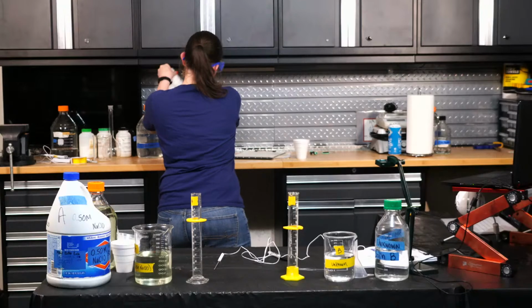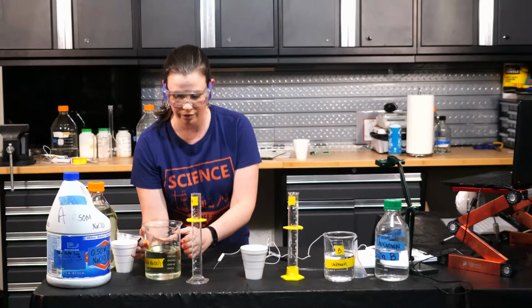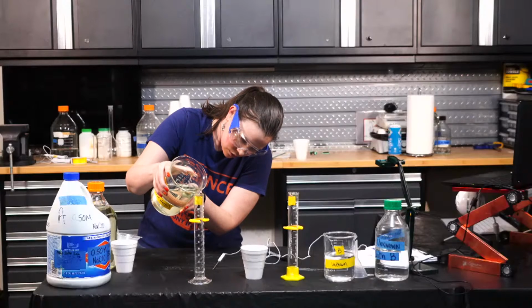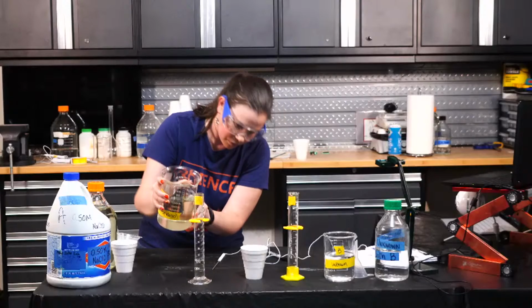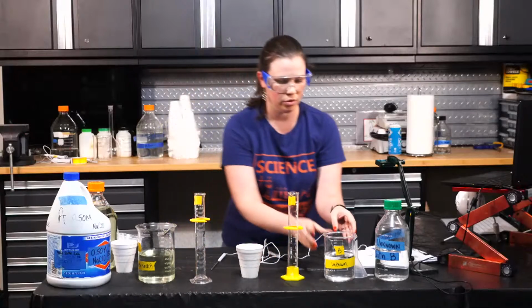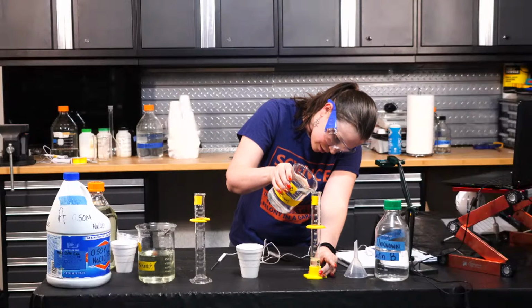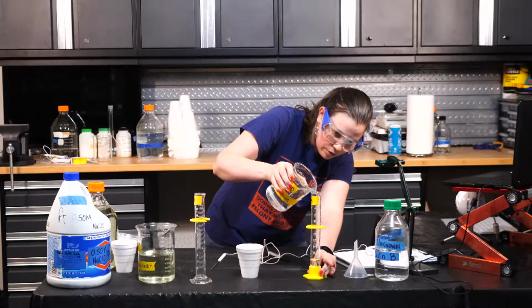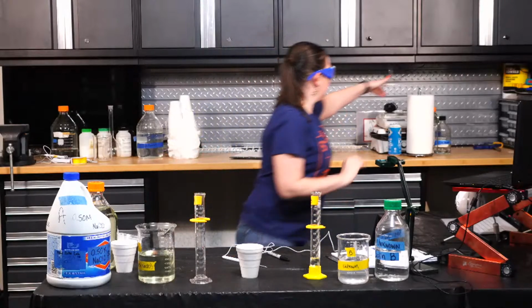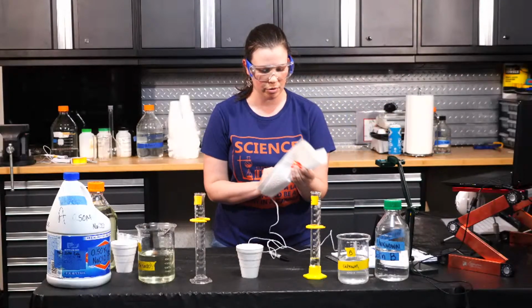And I'm going to mix level 3. Now level 3 is going to be 25 milliliters of each of them, actually. So there's my 25 milliliters of bleach. And I'm going to mix 25 milliliters of the unknown solution. Notice how I have everything in completely separate labeled containers to avoid cross-contamination there. All right, so now I'm going to grab a little paper towel and wipe off my thermometer, so there's no cross-contamination there either.